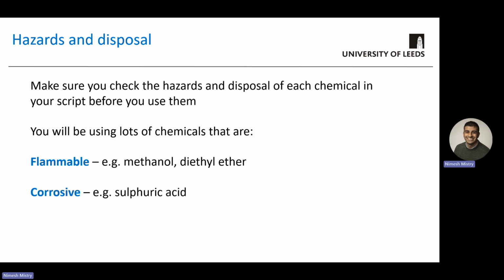So there's a key hazard here where maybe some of you are using diethyl ether for the liquid extractions. Some of you might be moving on to the distillation stage of the experiment and be using Bunsen burners. Do make sure that you're aware not just of what you're using, but what people around you are using. So we're not mixing these flammable solvents and heat sources like Bunsen burners closely to one another where fires can occur.